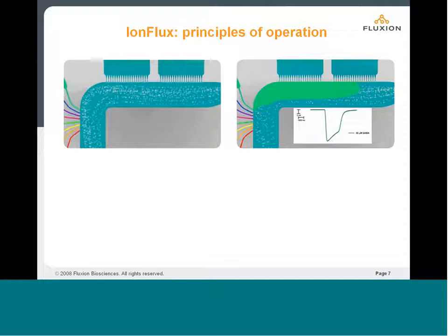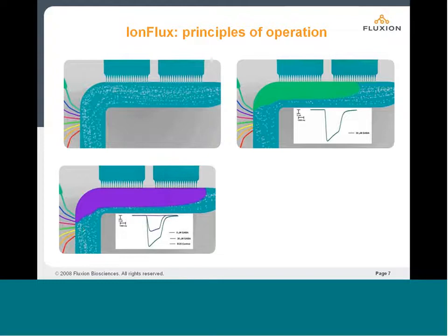And since there are two recordings in each experimental pattern, it means on an IonFlux 16 we have 8 unique experiments, 8 experimental patterns, or 32 experimental patterns in an IonFlux HT. And then we can step through having 8 solutions to choose from. And one of the things that I want to present this morning is within the software, how are we defining these delivery events within our user interface.